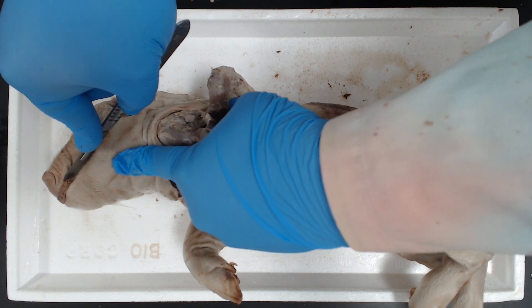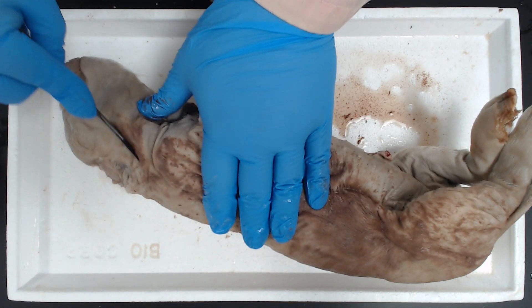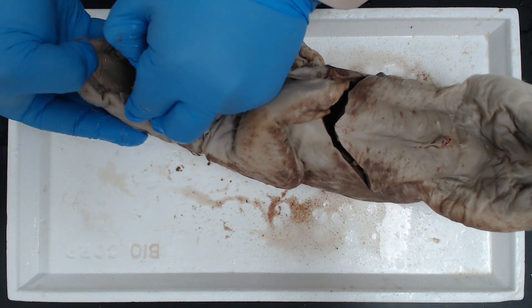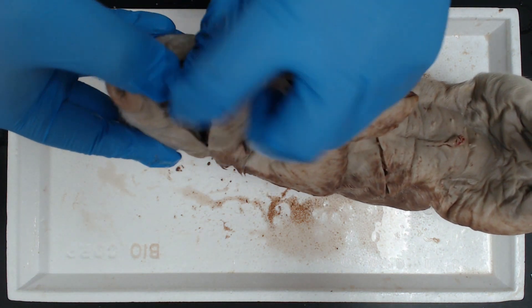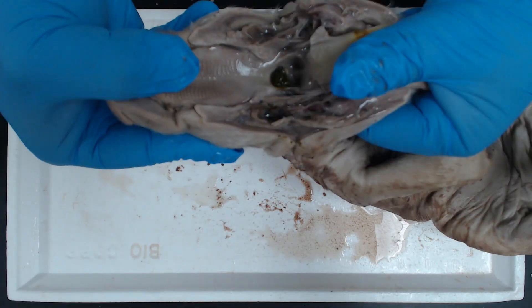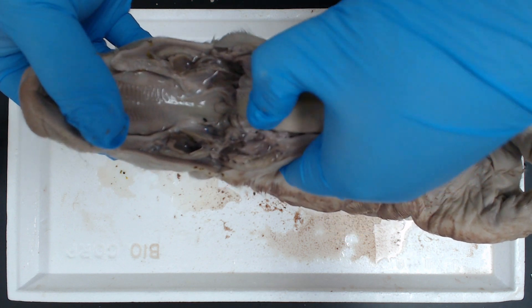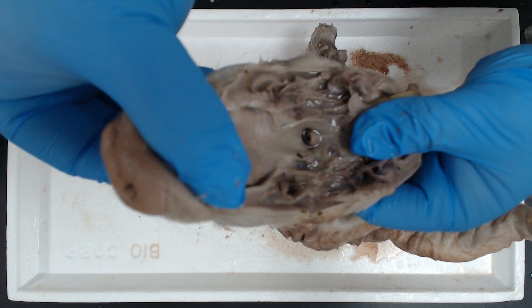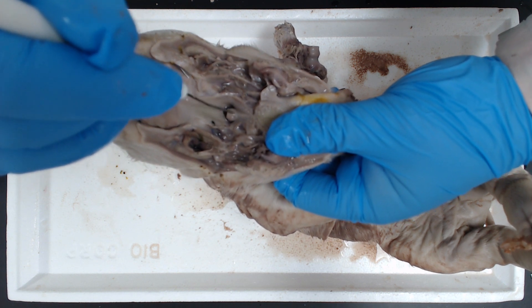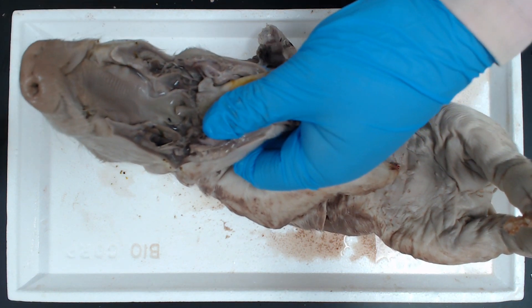So we're going to want to take a cut down the cheeks. It's going to make it easier for us to open up that jaw so we can see the epiglottis down its throat. And there's the epiglottis — it's right in the center there, a little flap.